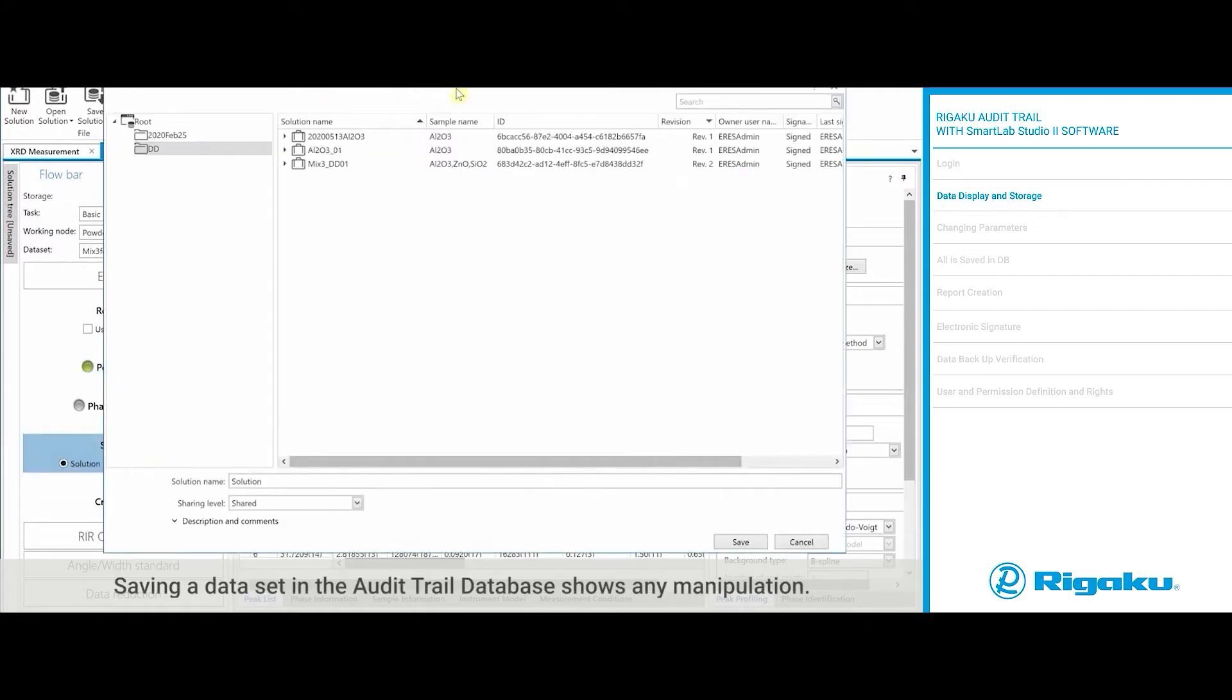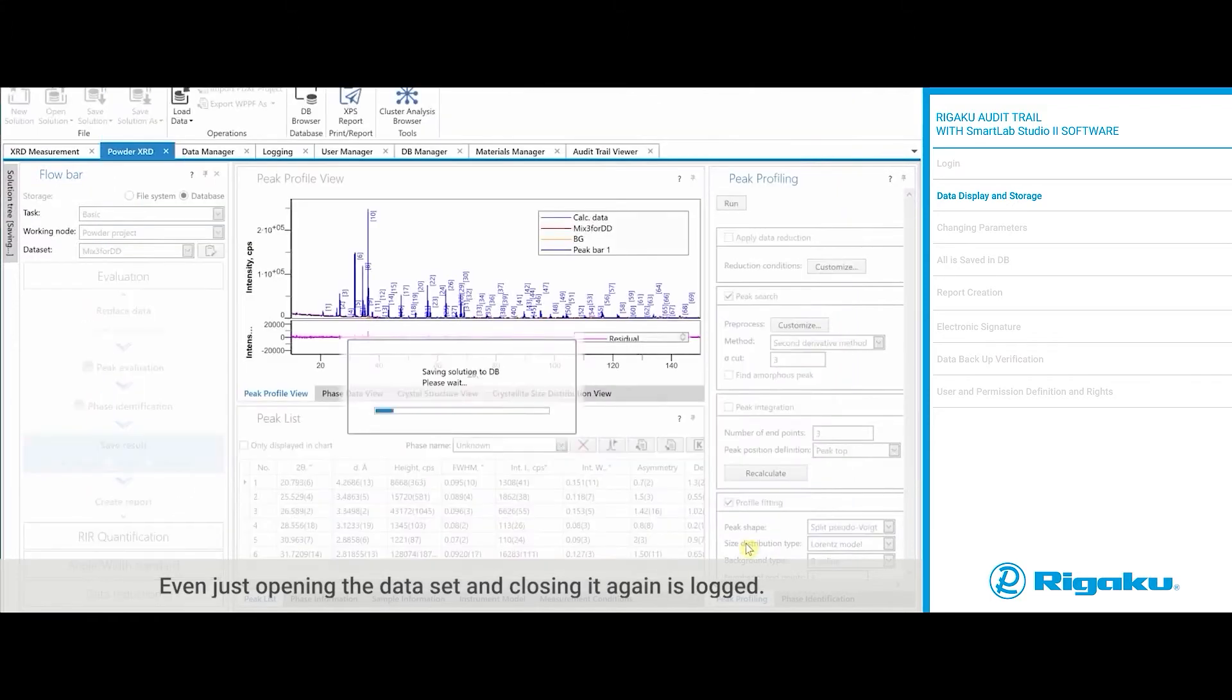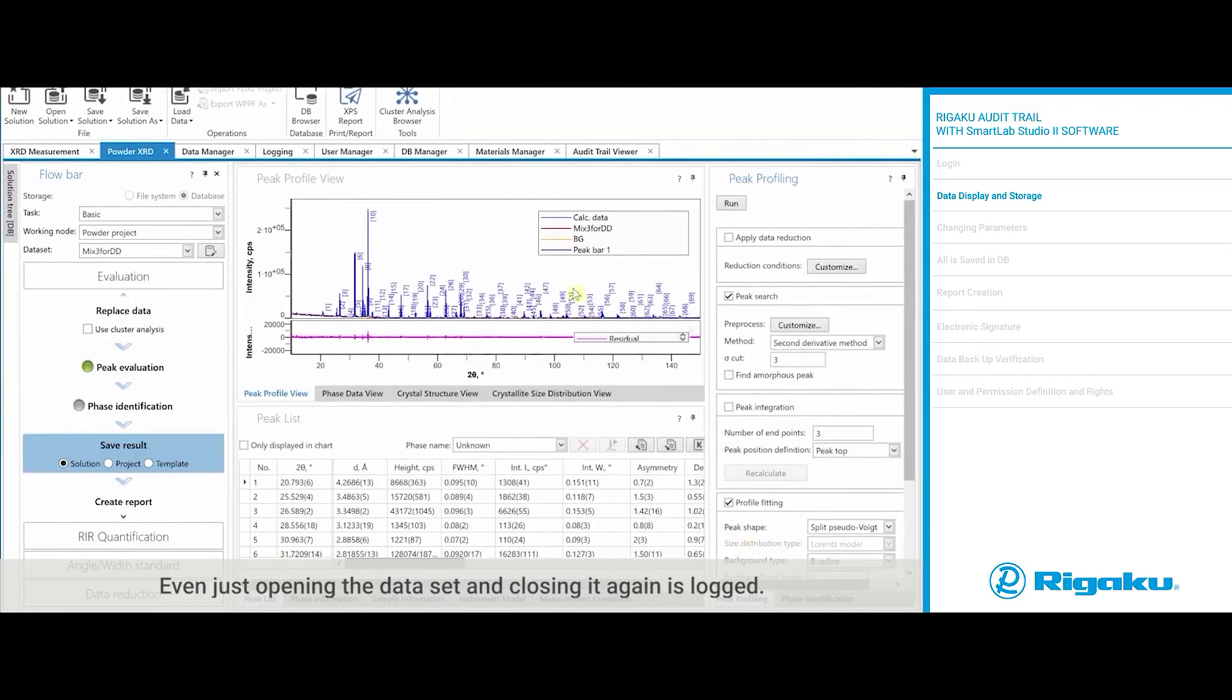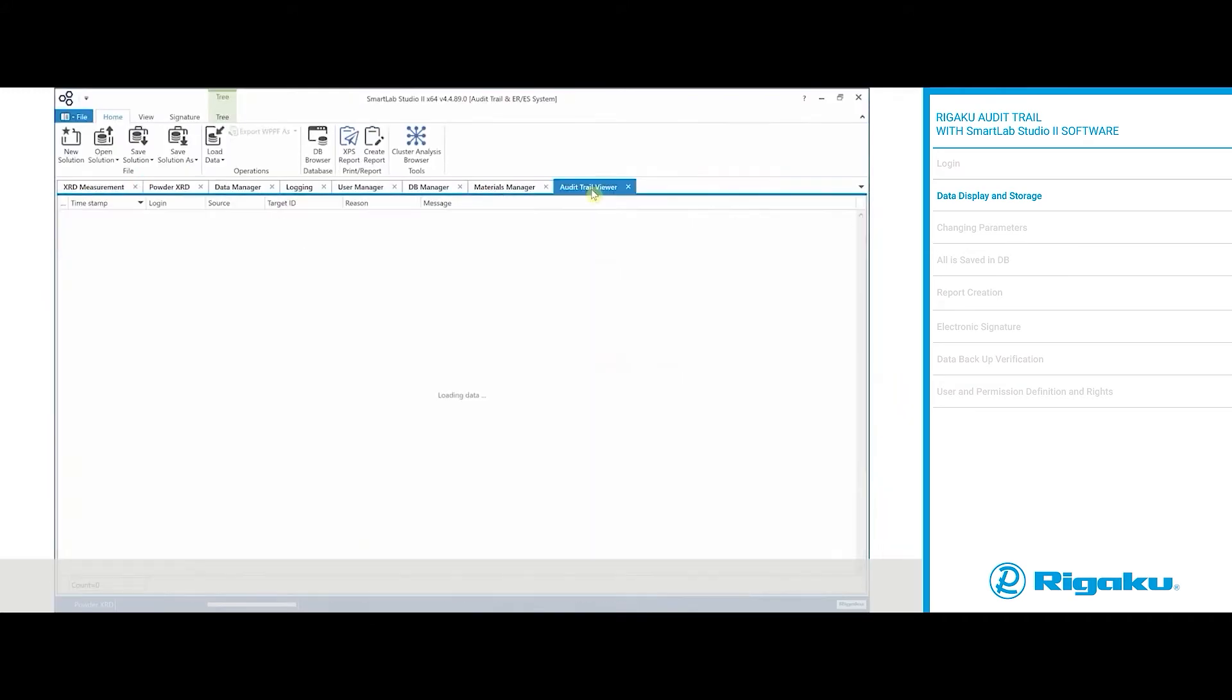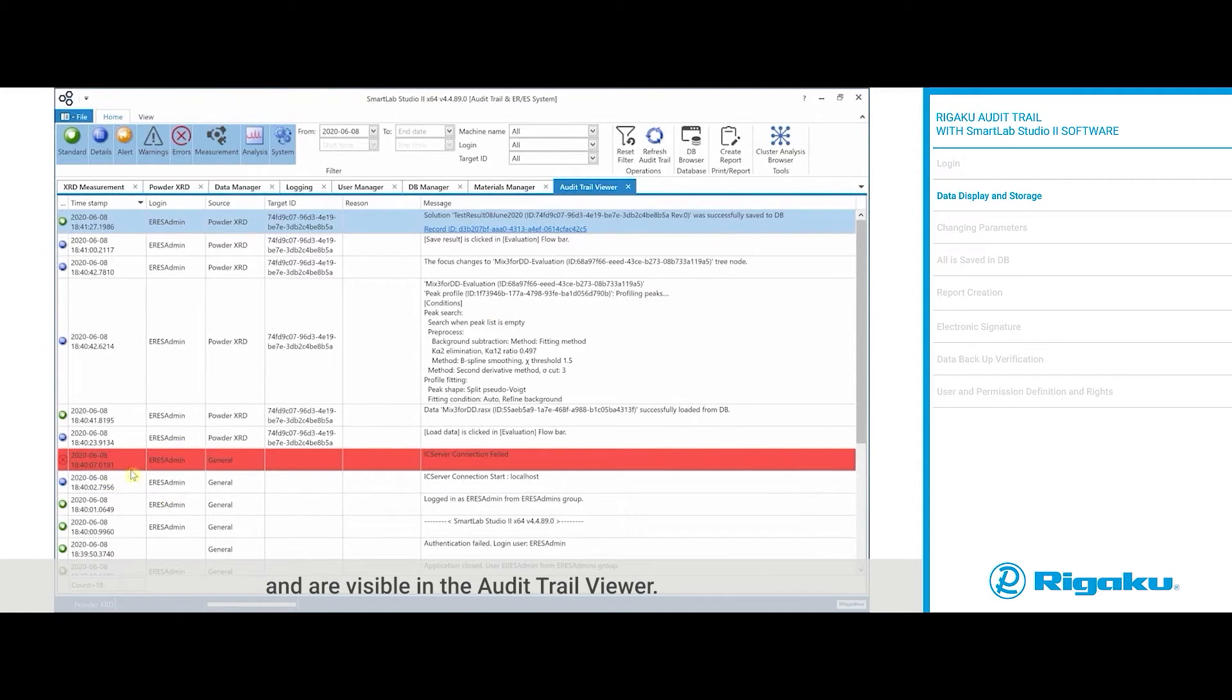Saving a data set in the audit trail database shows any manipulation. Even just opening the data set and closing it again is logged. All activities are captured in the database and are visible in the audit trail viewer.